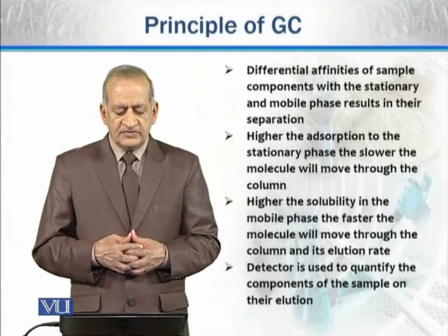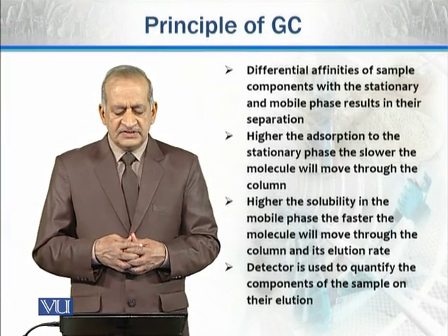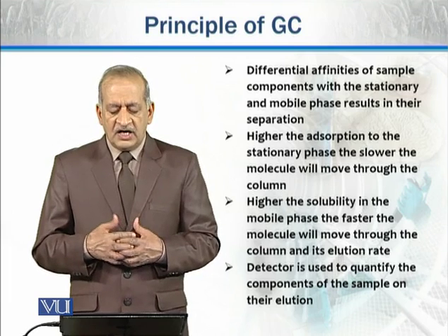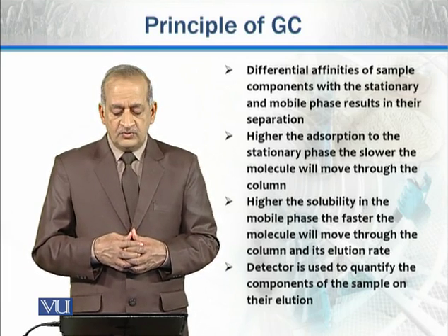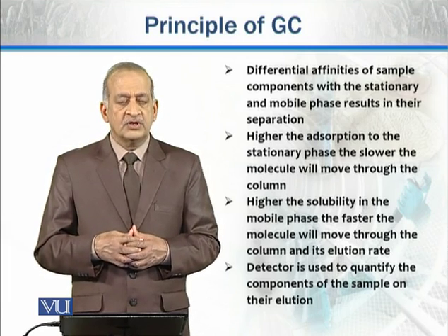Differential affinities of the sample components with the stationary and mobile phases result in their differential separation. The higher the adsorption with the stationary phase, the slower the molecule will move through the column.